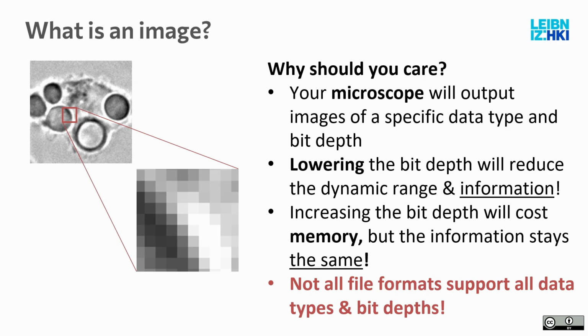I had actually a recent case where, no, this was a different one. But there were cases where people saved it out in the wrong format, for example. So there are some microscope software, I think, where you can tell the bit depth that it saves out. And some people might think, oh, the 8-bit, it makes a smaller file, then it doesn't use so much on the hard drive. You will lose information that is then gone, and it will never be able to return. It's like in a black hole, it's gone forever.